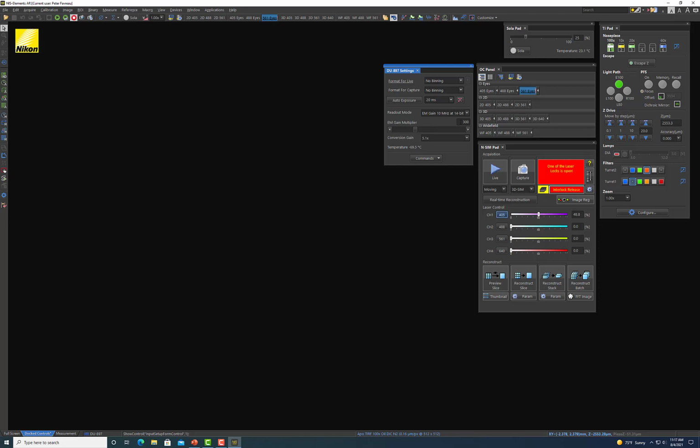So it's going to artificially bump up the brightness of your image while also introducing noise. Again, this is just an optimization parameter where the higher this value is, yes, the brighter your image is going to look, but you're also going to be increasing the noise threshold and your image will look noisier as a result. I consider 300 to be pretty high, whereas I think 100 or less is on the lower end. And that's actually ideal. If you can get an image where your gain is low, that's going to be ideal because you're introducing less noise into your image.